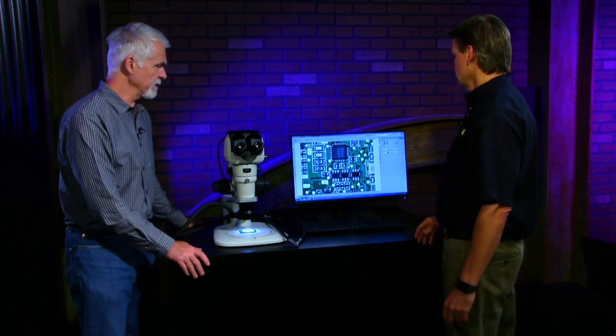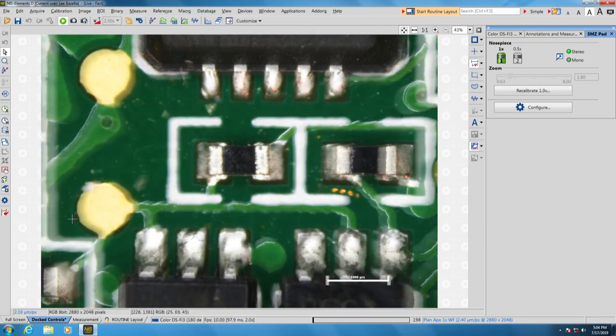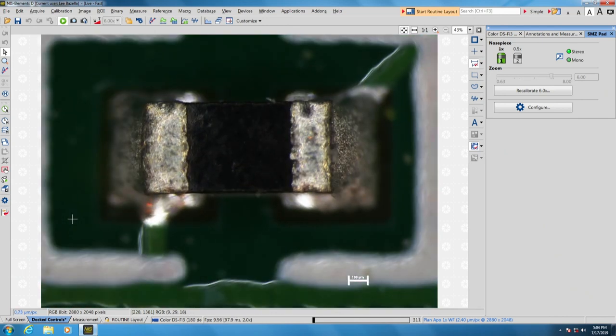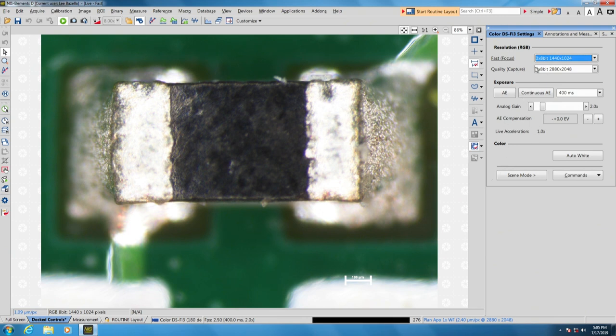Here's our Elements software. We're looking at a live image of a circuit board and I can zoom up—you can see on the software it's showing the zoom level increasing on the right-hand side, and the scale bar adjusting as you go up in zoom. At the highest zoom it looks a bit dark, so you go to camera controls and hit auto exposure to brighten it up. If that's too bright, you can manually lower the exposure, since it's trying to brighten the darkest areas and can oversaturate bright areas. This camera has two resolutions—you can lower resolution for a faster refresh rate for live viewing, then still capture at higher resolution. Even at the highest resolution, the refresh rate is quite good.